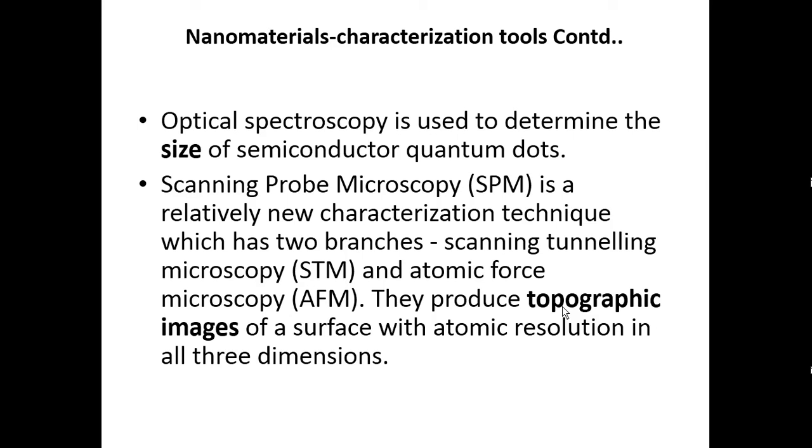At atomic resolution, the material dimensions or the measurements are being done with very accurate resolutions on the atomic level. Okay. So topographic images of surface with atomic resolution in all three dimensions.